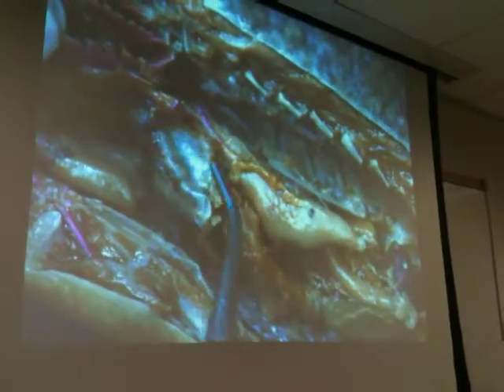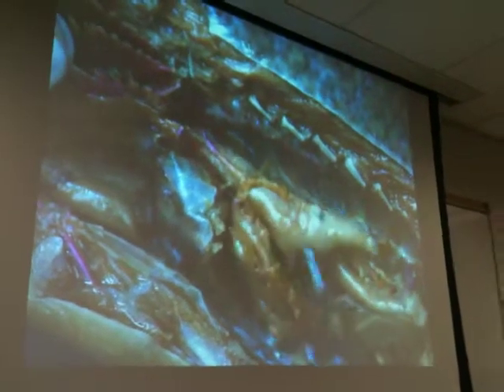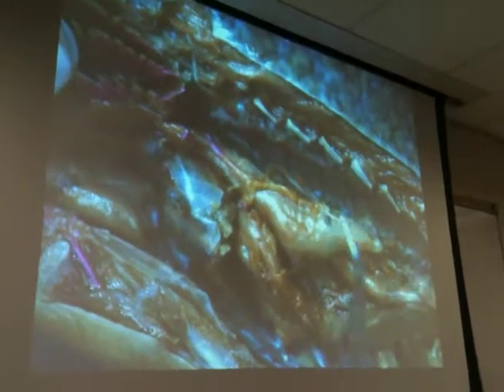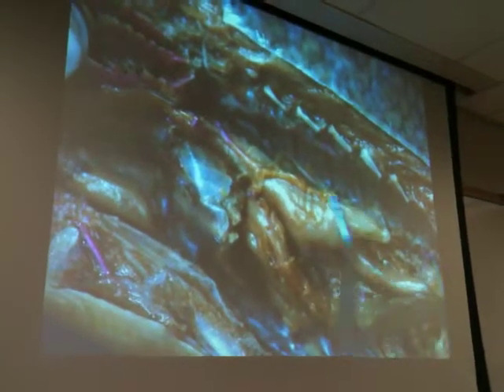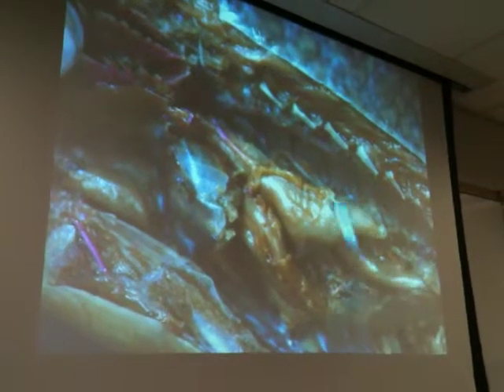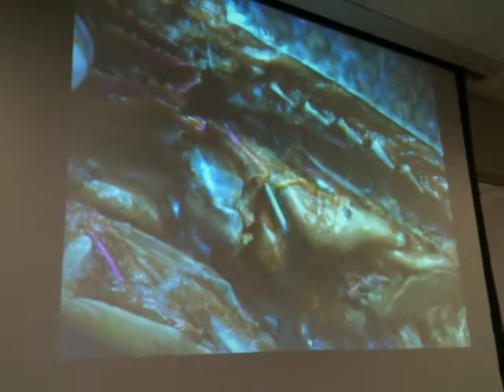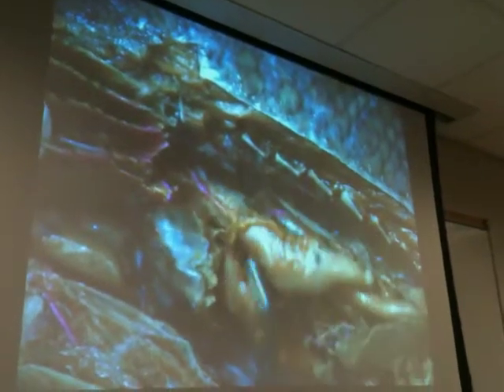Alright. So once you remove the liver, you'll have the stomach here. This is the stomach. Okay, some of you guys have a stomach where the finger-like portion extends out really far. But this portion of the stomach is the cardiac portion of the stomach, in here. Okay. And then what you want to find is a little offshoot of the stomach.